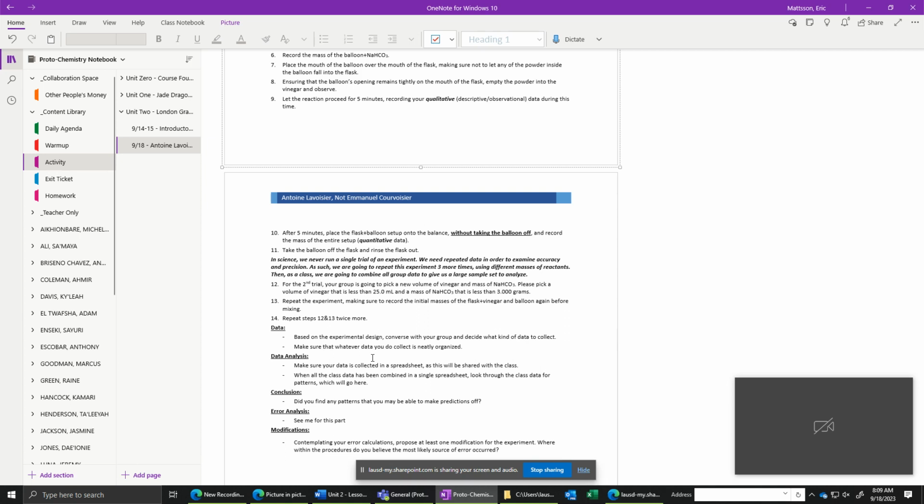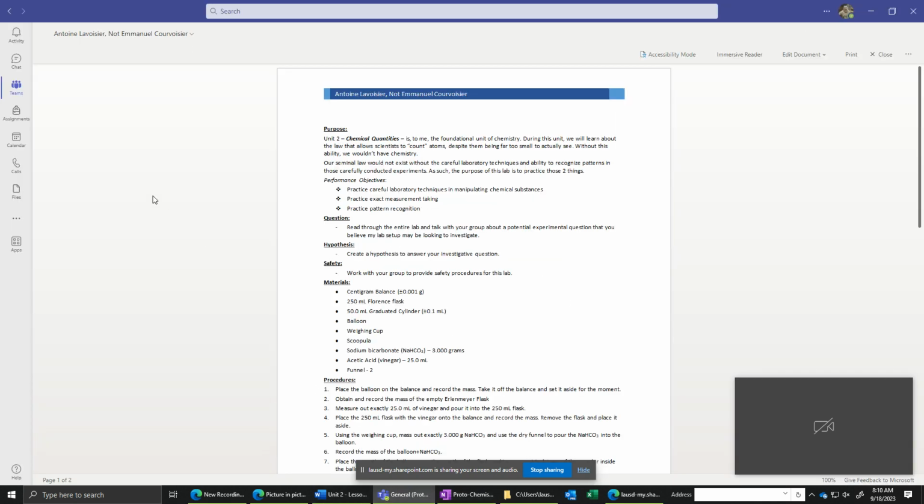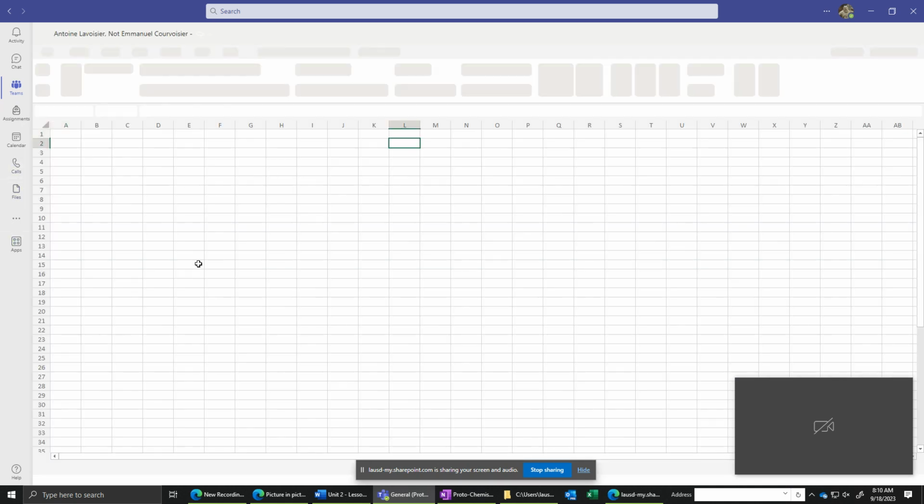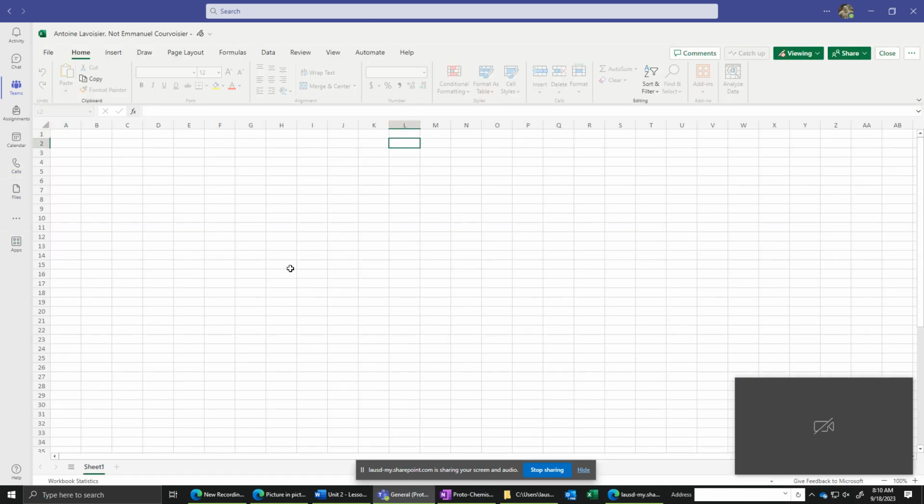Now, because we're taking careful measurements, we need to repeat this lab multiple times. So remember, we never draw conclusions in science based on the results of a single lab. We have to repeat over and over again. All right, so when we go back over here, close this out, you have your data workbook. This is just a blank data workbook that I just uploaded here for you so that you can start writing on it. There's nothing in here yet.